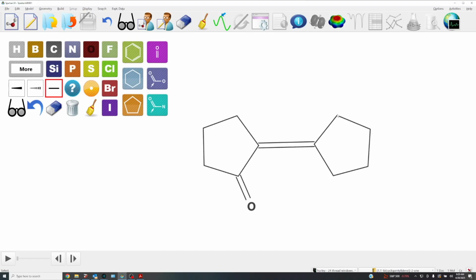And then what we'll do is we'll come up here and do the same thing. Let's drag up and then drag up again. Okay, so we'll make a carbonyl functionality up here and one down here. And then let's choose nitrogen just to the left of oxygen, and then just a double click to insert an amine here, to do a replacement, replace this sp3 carbon with an sp3 nitrogen.